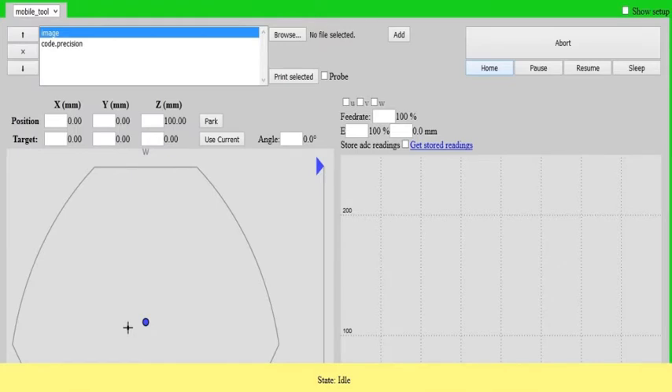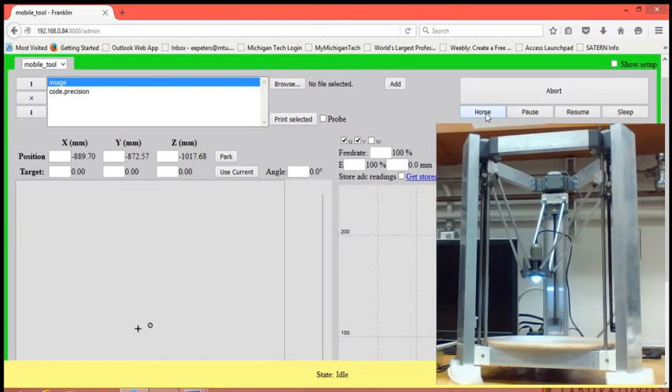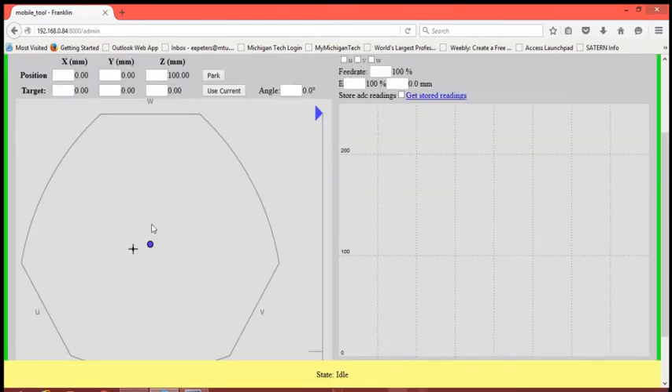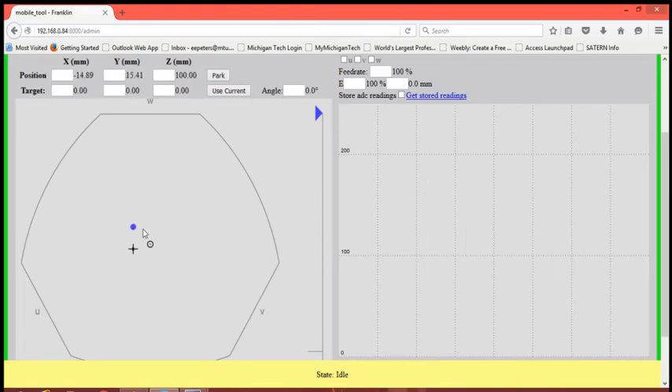All setup, configuration, and calibration is also performed from this interface. Click the home button to center the USB microscope over the base. There are a number of ways to move the microscope. For quick movement, you can click and drag the point on the interface or use the arrow keys on your keyboard. This will move the scope in steps of 10 millimeters. By holding the shift key while using the arrow keys, the scope will instead take steps of 1 millimeter.